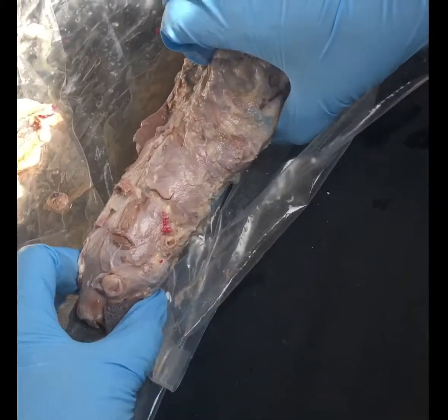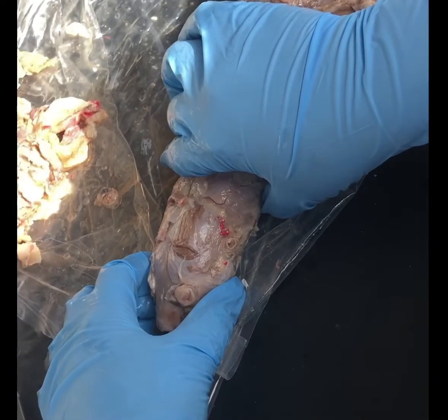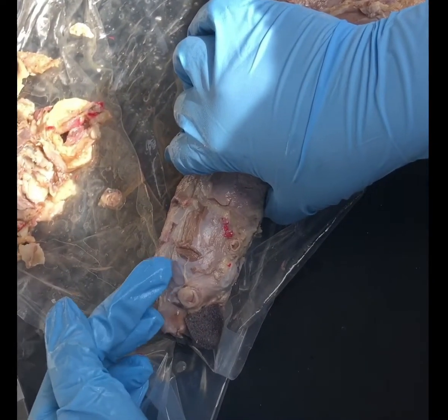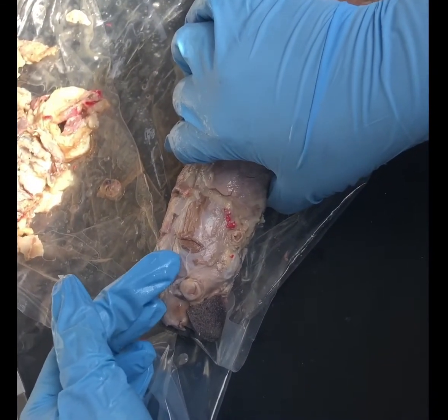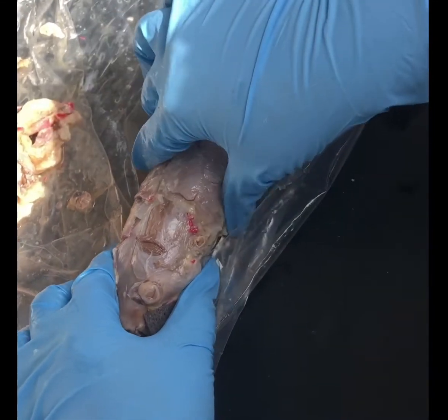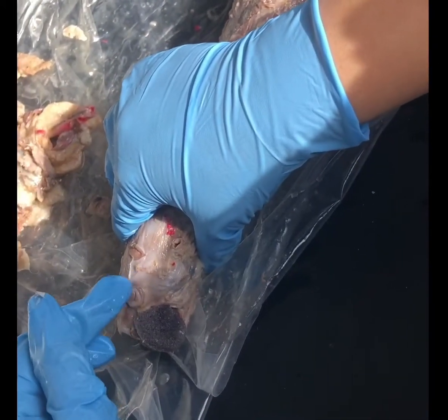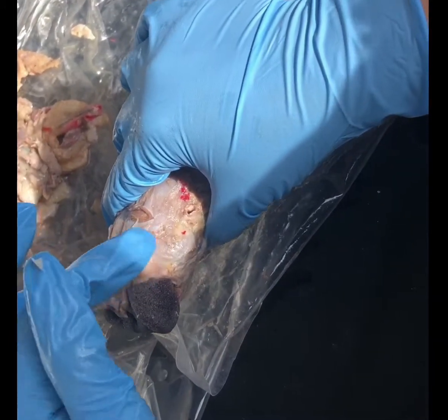Okay, so we're gonna do the muscles of the head first. The frontal belly of the epicranius is right here, the front side. The occipital belly of the epicranius is in the back. The orbicularis oculi, which is the muscle around the eye, right here, around the eye.